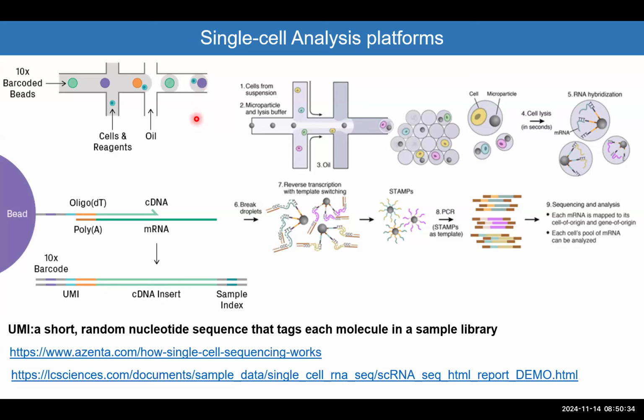So the efficiency is really high. There is 20% loss of the sample, so 80% of the sample will probably have cells and beads together. Now you will have within this oil droplet only one bead and one cell. Within the oil droplet, you will also have reagents. Among those reagents, you will have the reverse transcriptase, which will allow the reverse transcription and the generation of the cDNA library. They are showing you here the outcome.